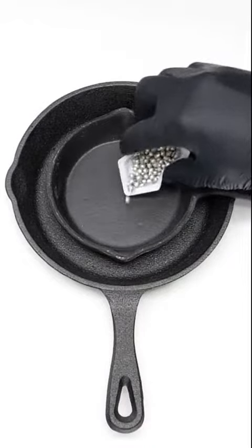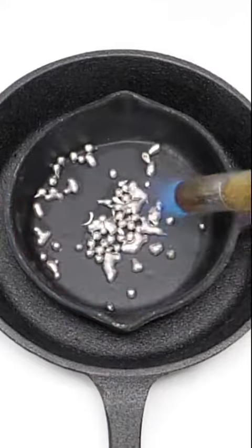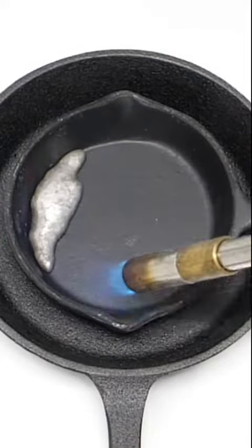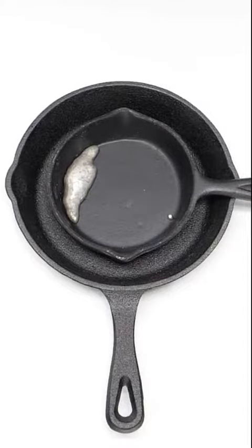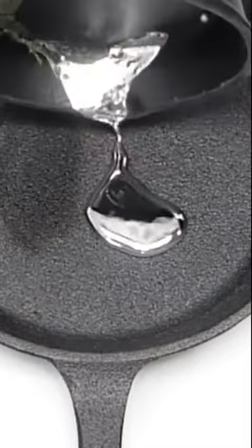I'll do this by adding a bunch to a dish and blasting it with a blowtorch. The melting point of tin is quite low, and it's really easy to melt. A lot of the impurities will float to the surface, and if I'm careful, I can pour away the clean metal.